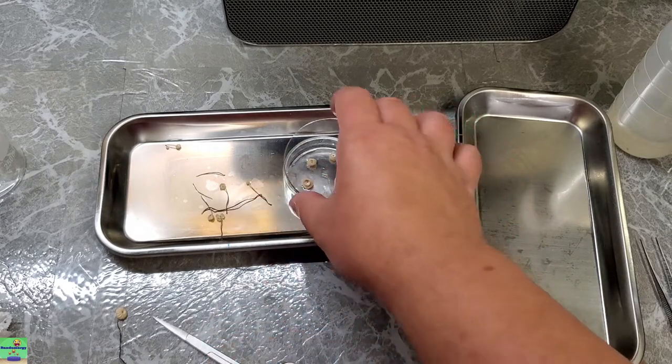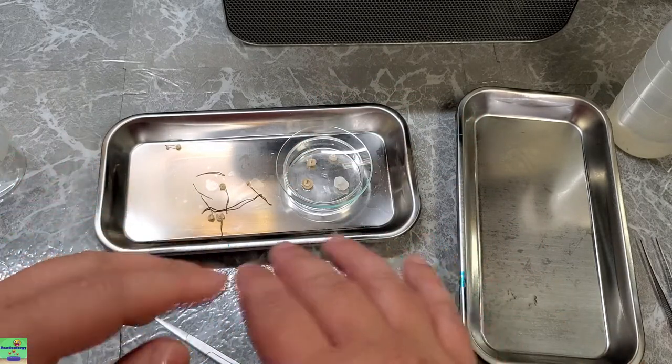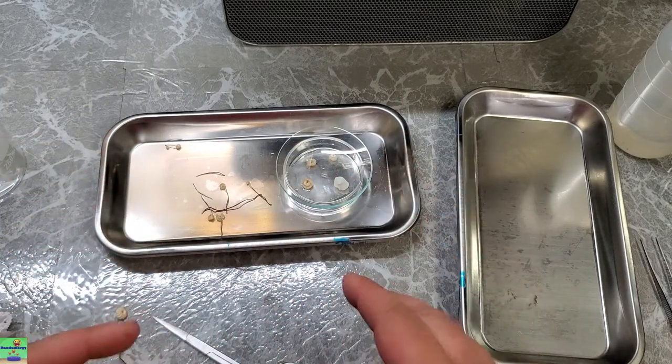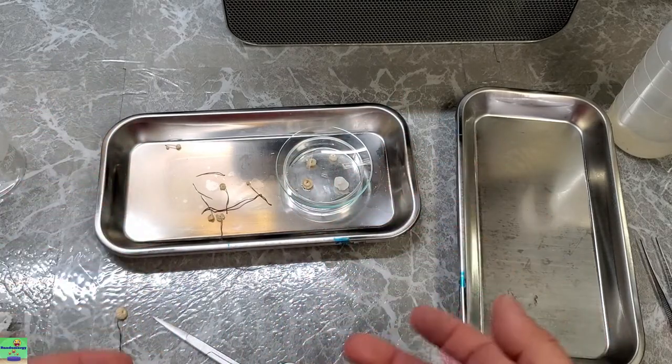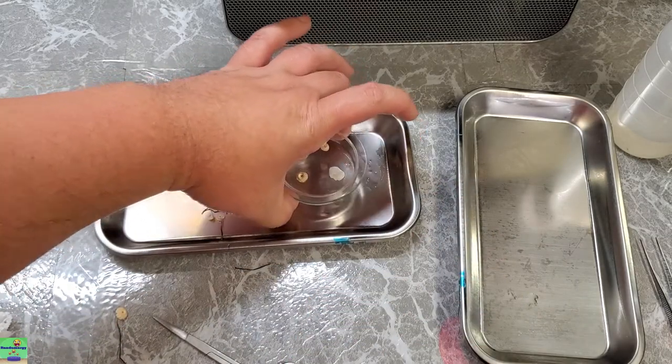And once that's all set up, you just take something and place it over the top. Obviously, if you're doing this on aluminum foil or a styrofoam plate or a piece of paper or whatever, you know, just invert a coffee mug or something over this. You don't need to have an elaborate setup like I do.